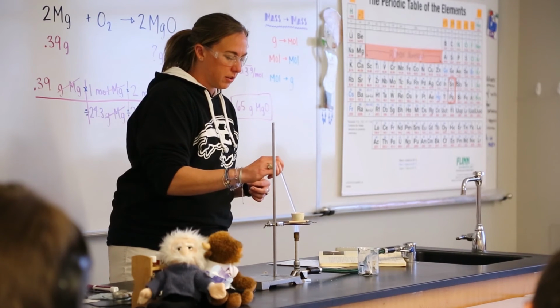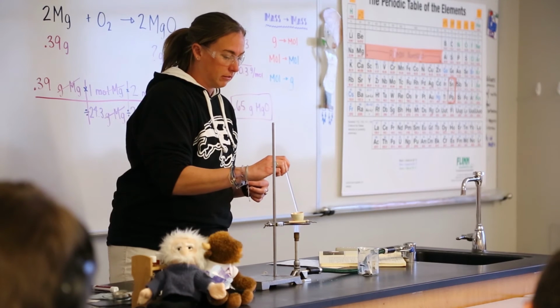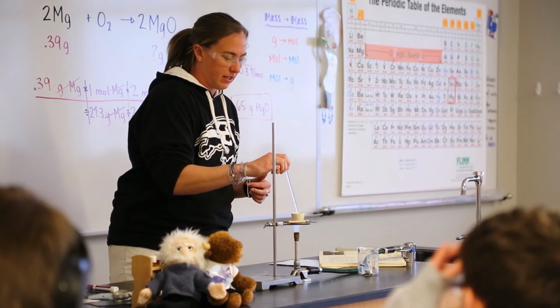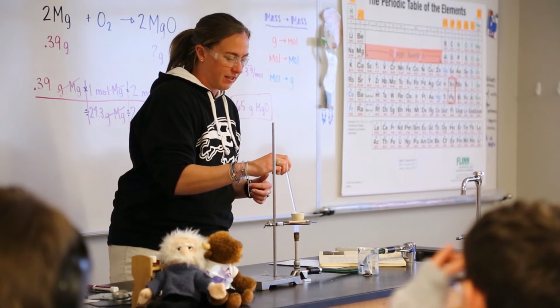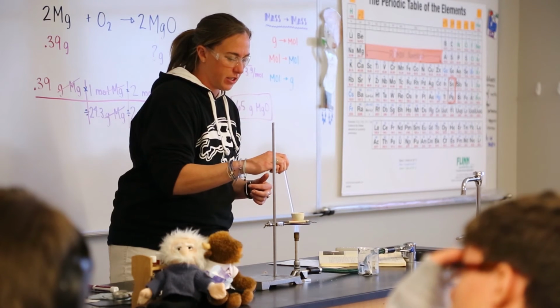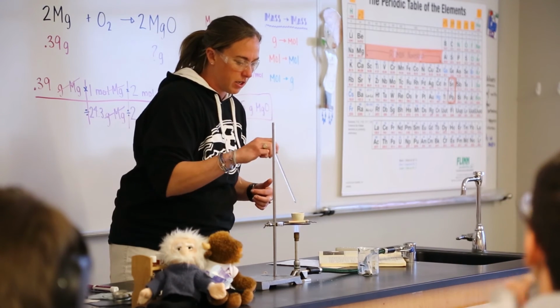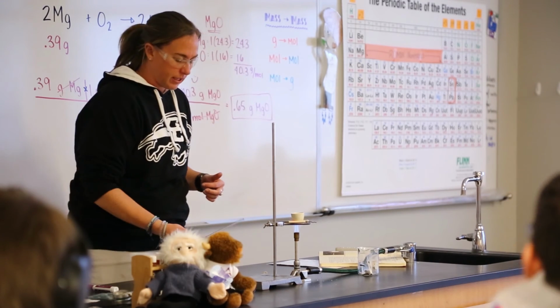Okay. My heart like skipped a beat. All right, so I'm crunching it. Do you guys see any more bright white lights? No, it looks pretty much done. All right, so let's see how we did.